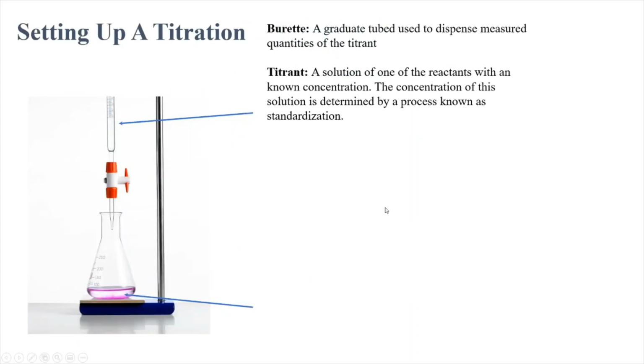So let's look at how we set up a titration. I'm going to go through some of the basics first, and then we're going to look at a video that walks you through all of the steps of a titration in detail. So I'm going to give you some introduction, and then we'll break it down where you can actually see the whole thing being set up and being performed.